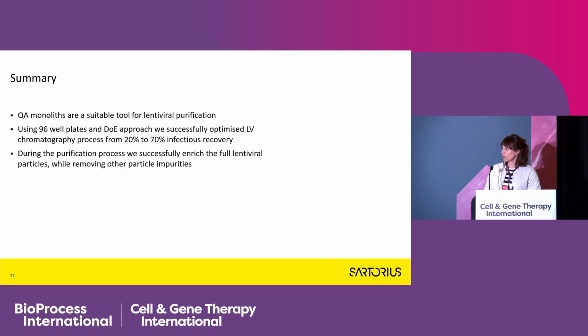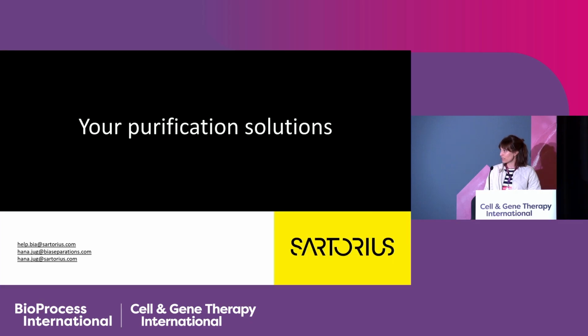So to summarize, QA monoliths are a really suitable tool for lentivirus purification. We used 96 well plates and a DOE approach, and we successfully optimized the lentivirus chromatography process from 20 to 70% recovery. And during the purification process, we also successfully enriched the full lentivirus particles, or let's say positive particles for these 3 components, while also removing other particle impurities.